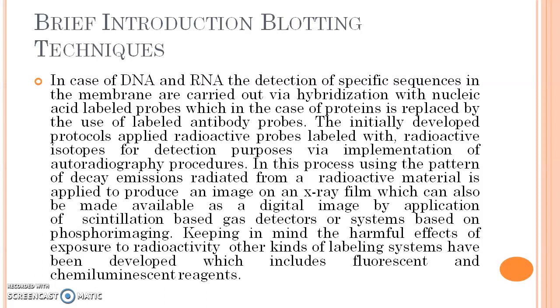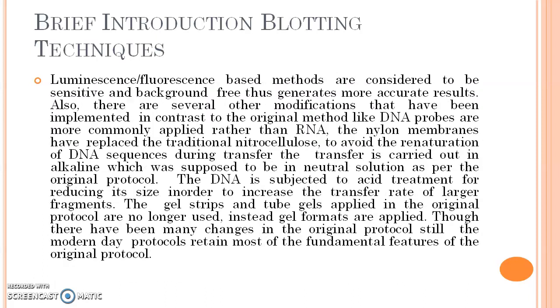Keeping in mind the harmful effects of exposure to radioactivity, other kinds of labeling systems have been developed, which include fluorescent and chemiluminescent reagents.